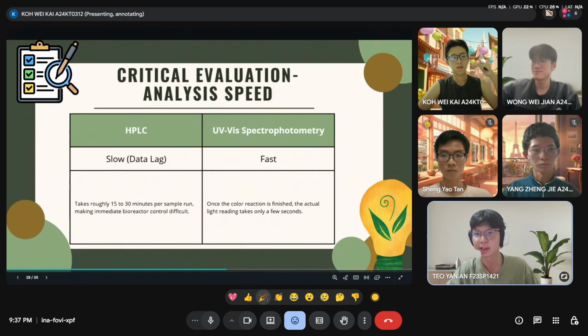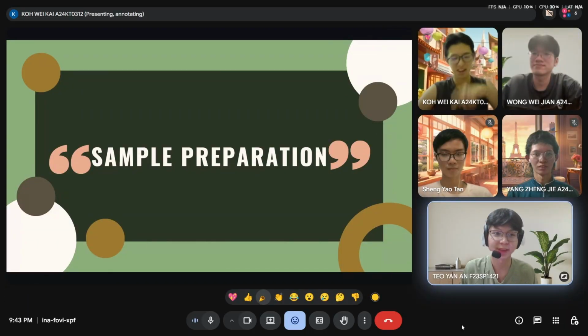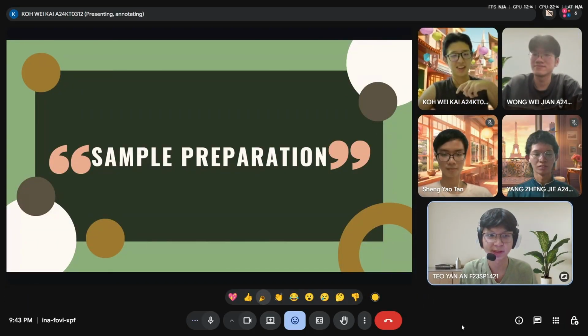This is because HPLC will take 15 to 30 minutes per run to get all the samples, but the UV-Vis only takes a few seconds to take one sample. Okay. So Mr. Seng Yao, can you talk to us in more detail about the sample preparation?